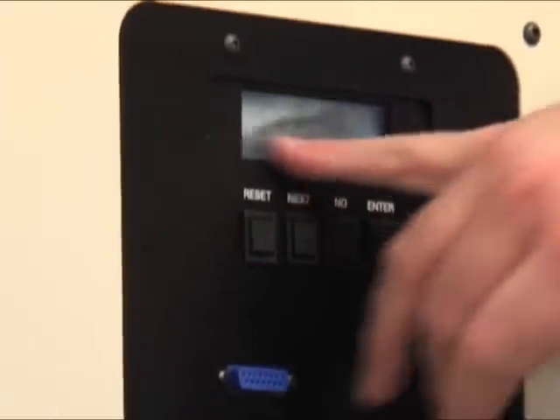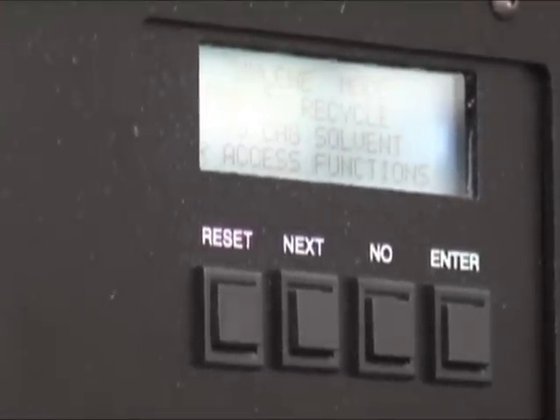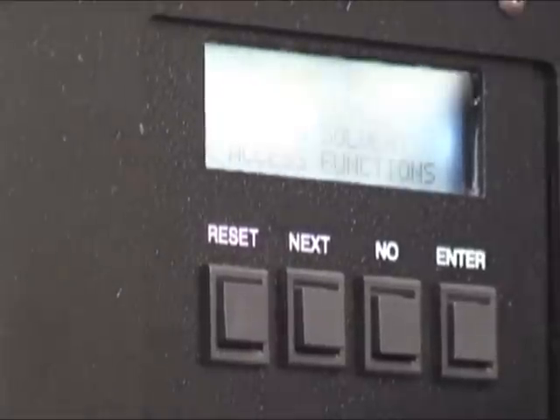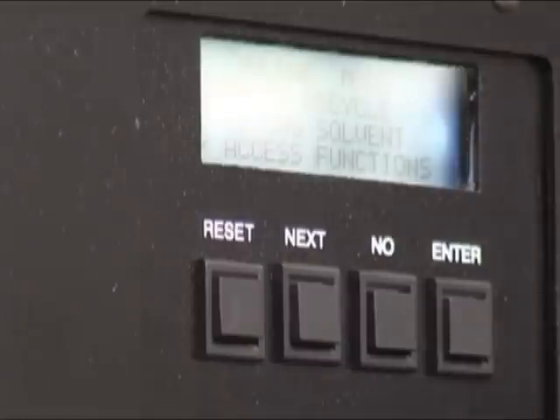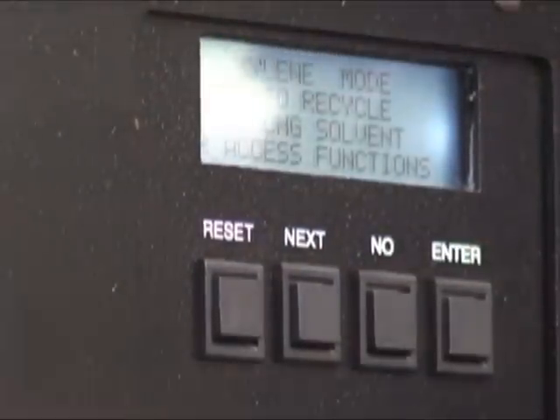What we have here is xylene mode — enter to recycle. If I want to recycle xylene, all I do is press enter. The next line is no to change solvents or access other functions. Really all you need to be concerned about is changing your solvents — whether you want to do alcohol, xylene, or something else.